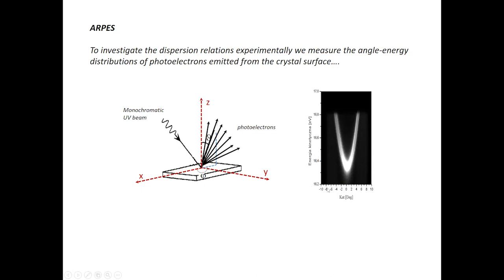Yeah, so it's kinetic energy here, so electrons over the surface, and this is angle here. This is of course a limited angular space, because if you have 2D or 3D, it's more difficult to represent. So it's just a section here in this angular space. Angular space and K-space are really close one to another. We told about that already before.